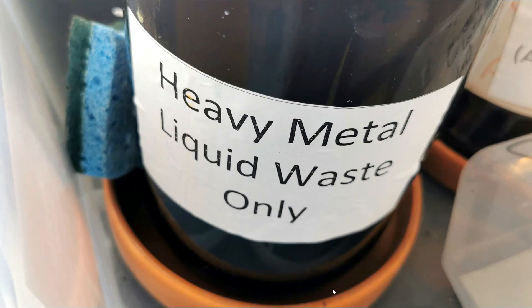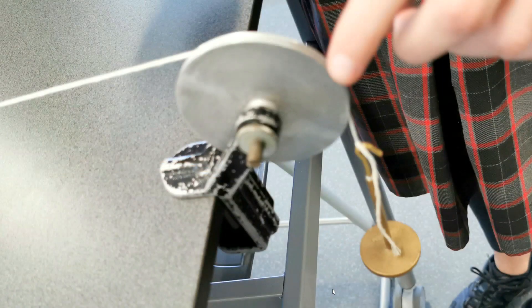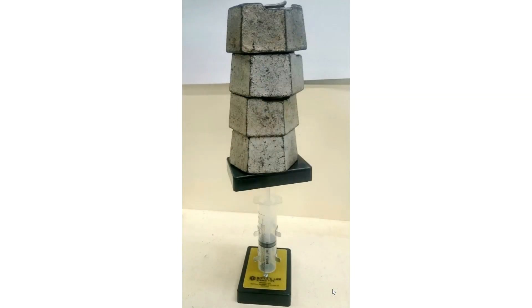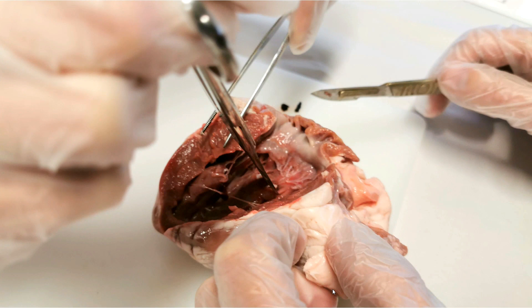What I've been showing are just general items that you find in a science lab. You'll be using other things too — a light box for physics with mirrors and prisms, pulley systems, trolley systems, a syringe with masses to look at Boyle's law, a microscope, a dissection kit. Depending on what you're actually doing, other materials or equipment will be brought into the lab as well. So yeah, that was a bit of a refresher on the things you'll be using in the science lab.